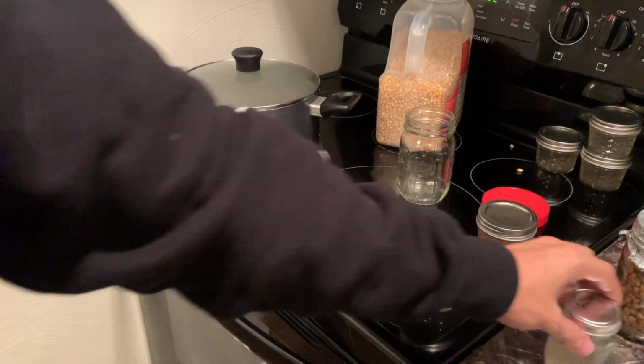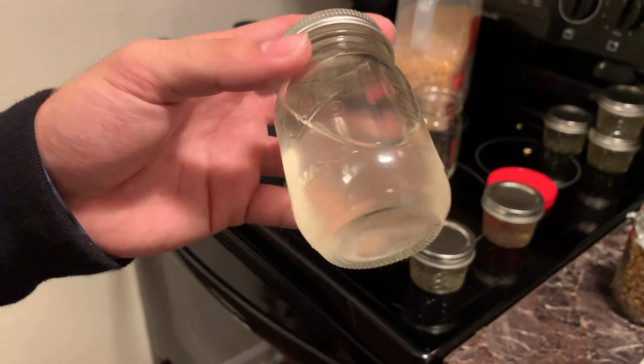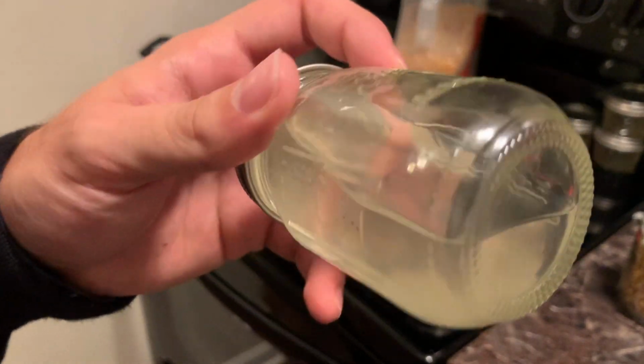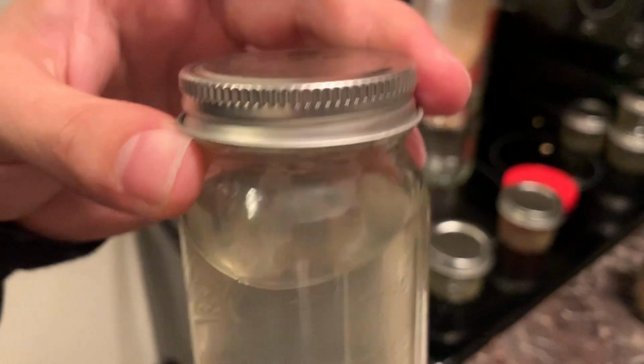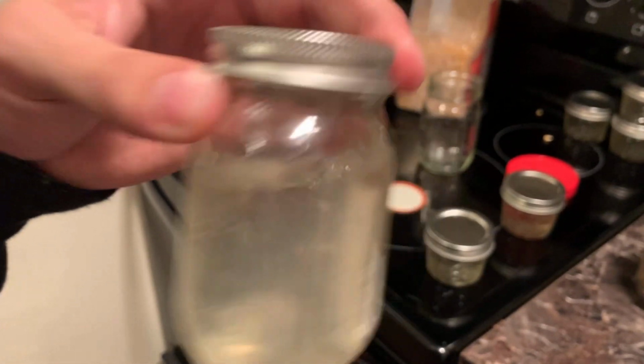And then you could just throw a little slice of agar or another liquid culture that's gonna grow in there, some spores possibly, and you'll get a nice little liquid culture jar.